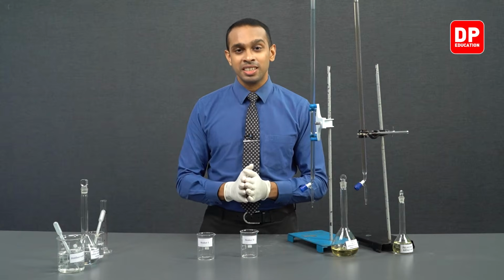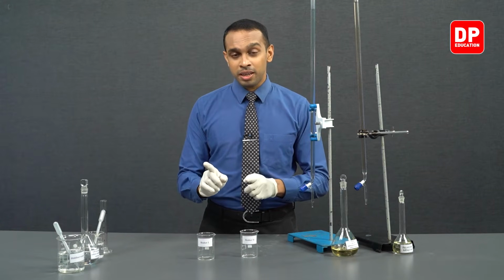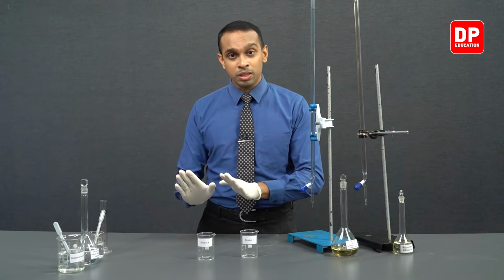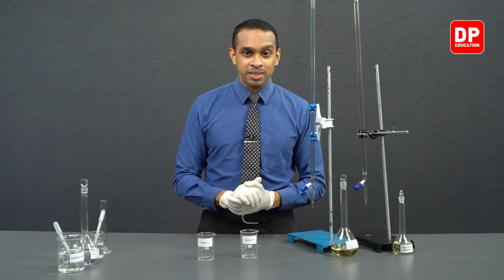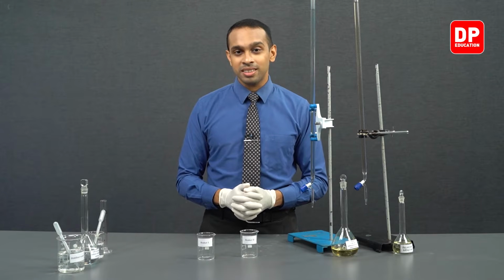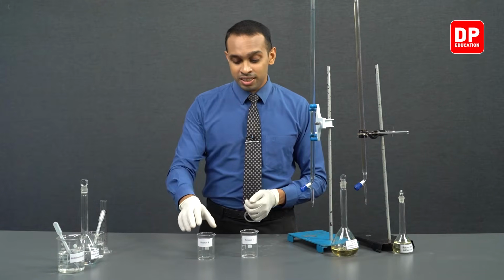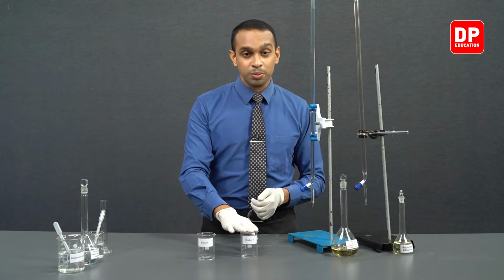So in this case, in simpler words, we are going to observe the time taken for a certain amount of iodine to be produced when we keep on changing the concentration of Fe3+ ions. So students, with that in mind, we are going to be moving on to measuring the different solutions we need to be taking into each of these beakers.